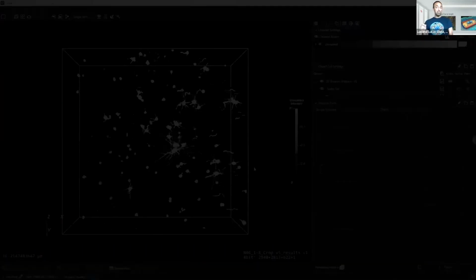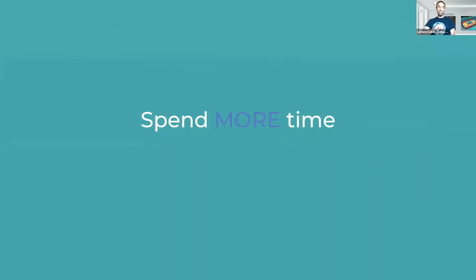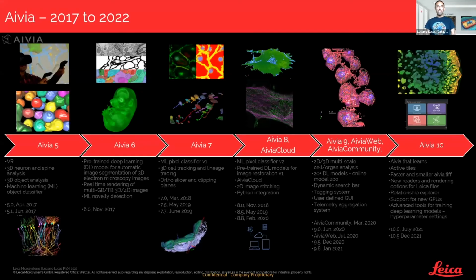And you're not applying a deep learning model at that point. You're just applying a regular algorithm, thresholding with, it's actually voxel scooping. But the deep learning model that we train is to predict the parameters that go into that GUI, that interface. So that's the concept. We're testing it out on many different applications. We've done it for 3D objects, standard, like potato-shaped objects, for neurons that are much more complicated, and we're testing it out on other things like complex cells and tracking exercises.